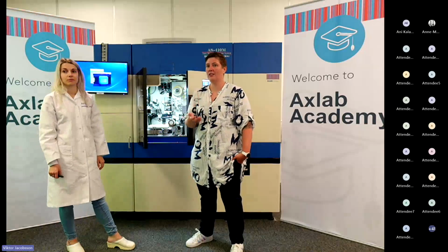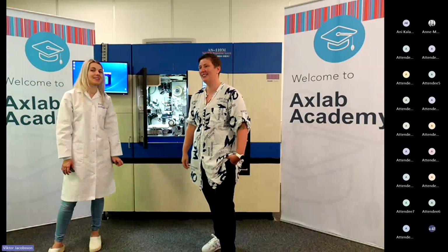How many technologists are you currently employing with 1,200 blocks per day? Currently, we have 50 technologists in the histology lab. And again, as I said before, it's not very many of them that are actually sectioning blocks. And when I said 50 is high, it's the norm that, if it's a good day, we have like 40 at work because there will always be vacation, maternity leave, or something like that. So on a good day, we will be 40 at work. It's a very, very good day. Okay. Do you have one more question?